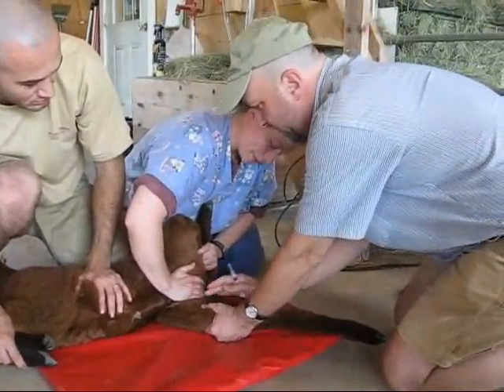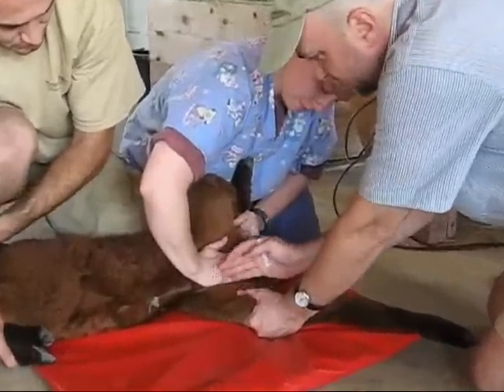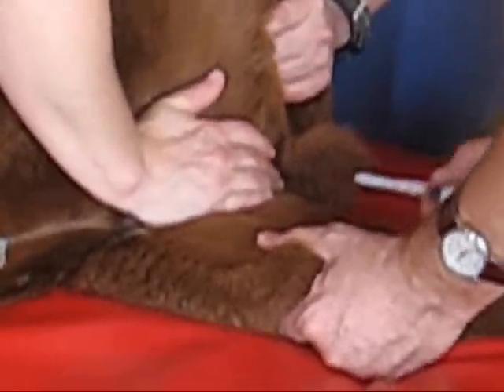Jay at Light Livestock here again, and we're doing a blood draw from the leg of a camelid, using the vein on the inside of the leg. Chantel is occluding the vein so that we get some buildup, and I am steadying the vein with my thumb as I hold the leg.